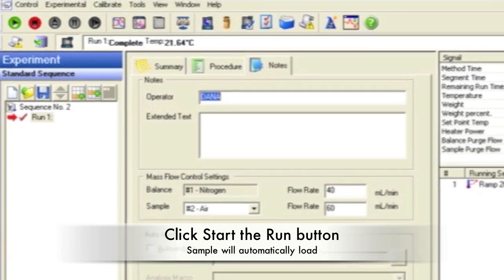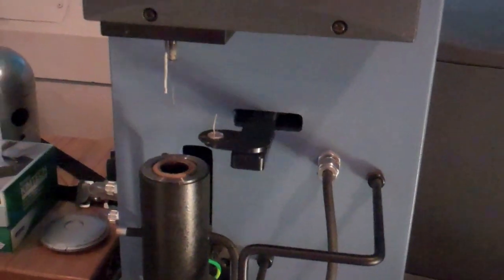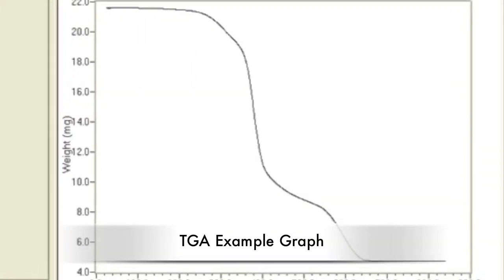Click the Start the Run button to automatically load the sample and begin the test. Runs take half an hour to an hour, depending on the final temperature and the heating rate. This is a typical TGA graph showing the weight loss as a function of temperature.